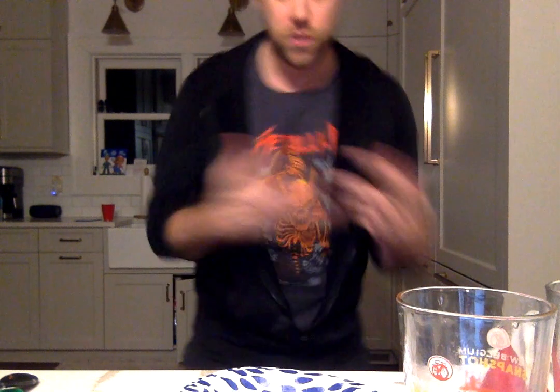Today we're going to do the iodine clock reaction. This is a great demonstration of chemical kinetics and reaction rates. This experiment will show a slow reaction followed by accumulation of iodine ions to a fast reaction. The idea behind this experiment is to mix two clear substances, and after a certain amount of time, a sudden color change will occur.